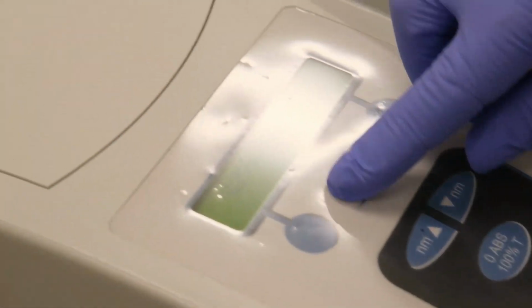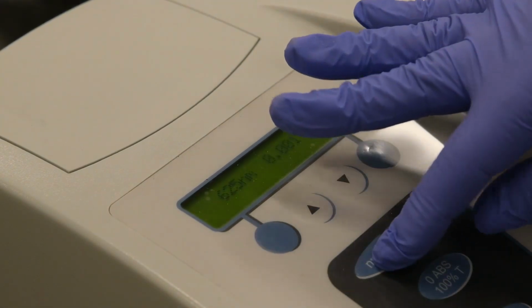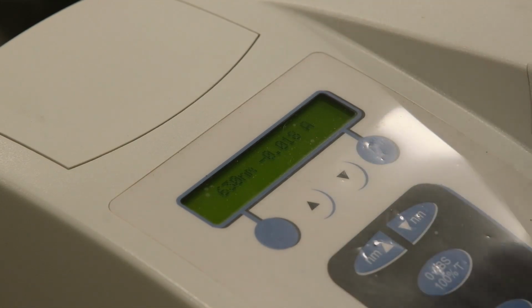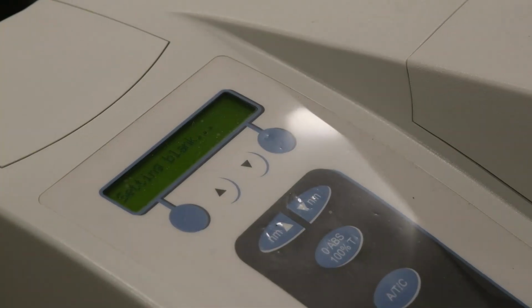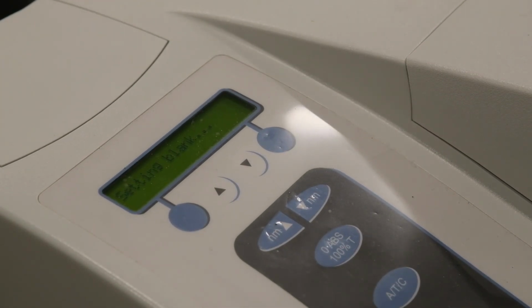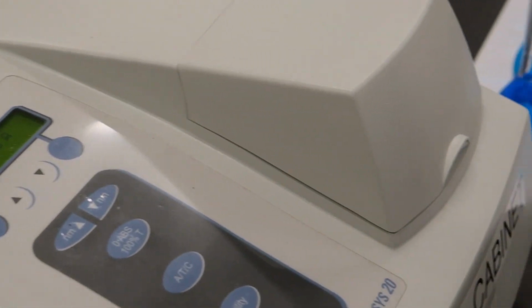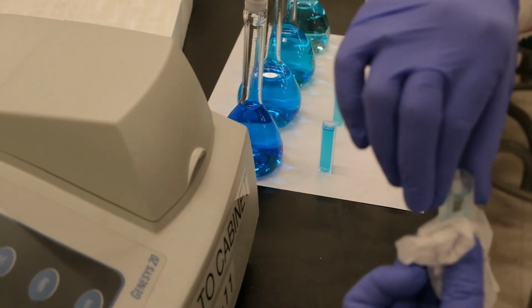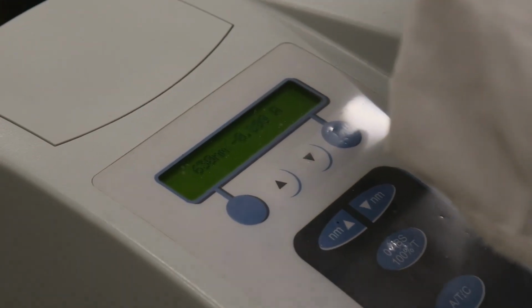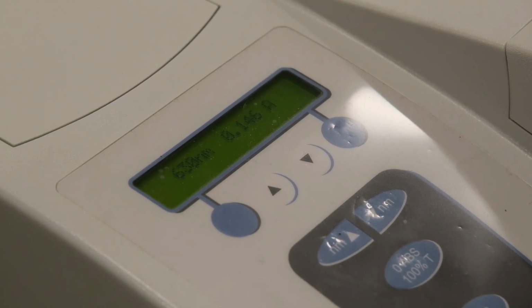We set up our maximum, then we put in our blank, zero the instrument, start from the least concentrated solution, and you need to show your calculation in your notebook on how you found out which one was the correct concentration.